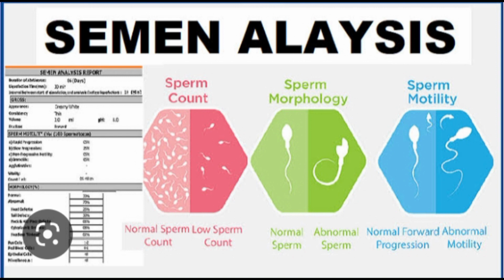For this, a thick smear covered with a cover glass is prepared and this preparation is sealed with Vaseline. It should be examined hourly. A normal specimen shows little cessation of motility at the 3rd hour after emission, and cellular activity is noted at the 5th or 6th hour also.